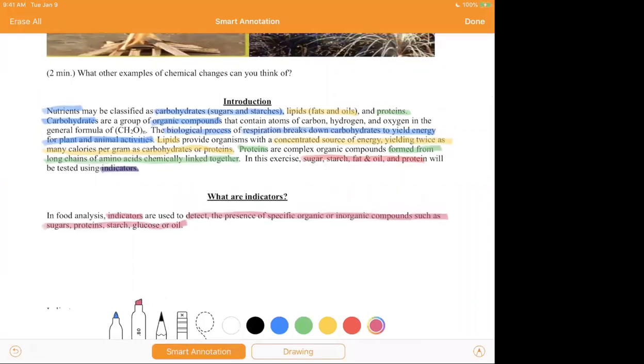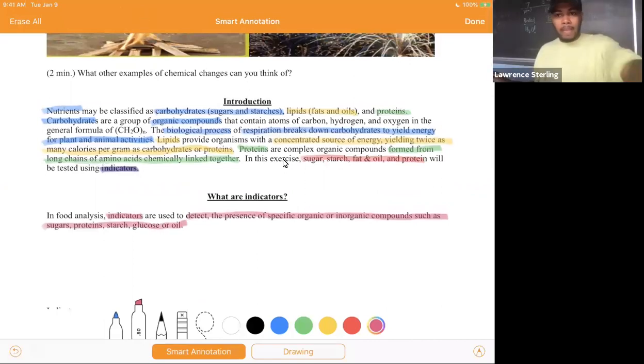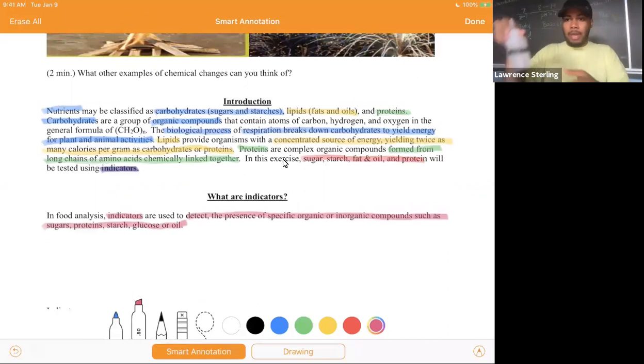All right? So I'm going to start my video. All right, I hope you guys can see me. So here we have glucose, which if you remember is a simple sugar, it's a monosaccharide. That's one of our nutrients, glucose. Our second nutrient is starch, which is a complex sugar.